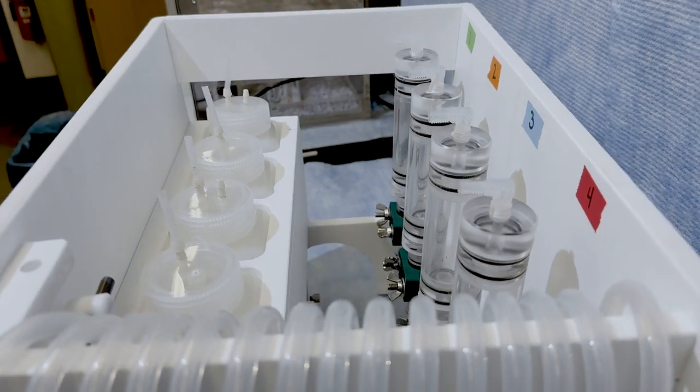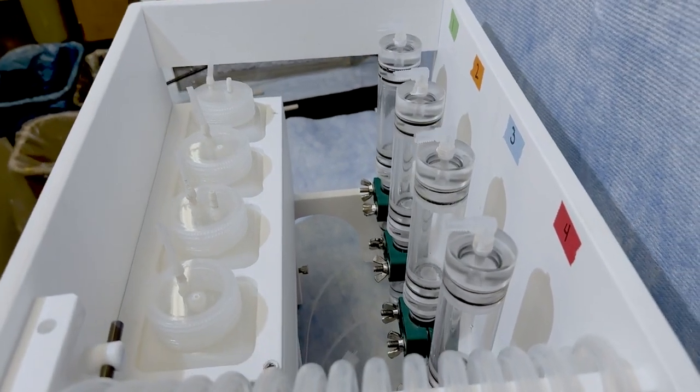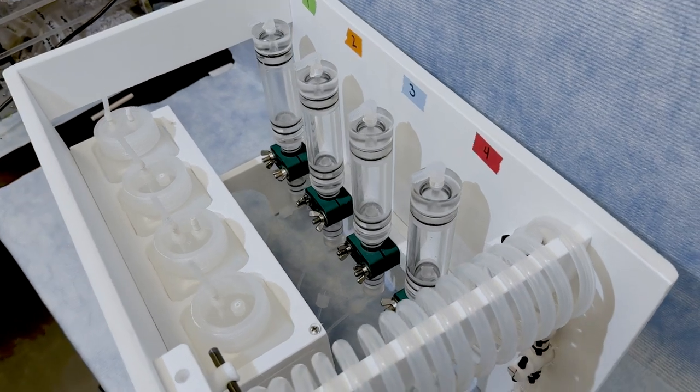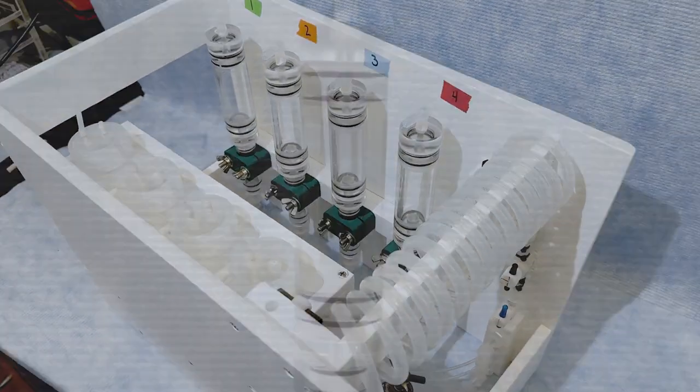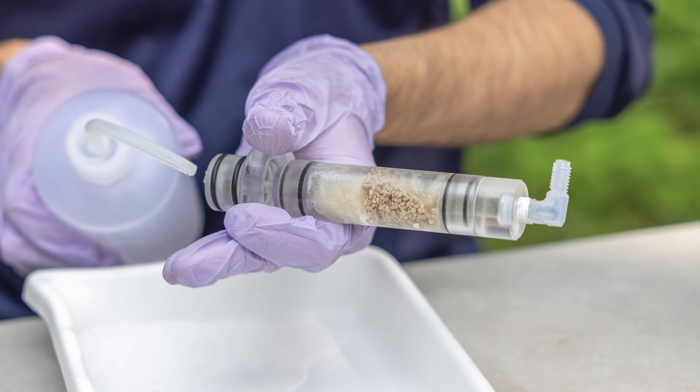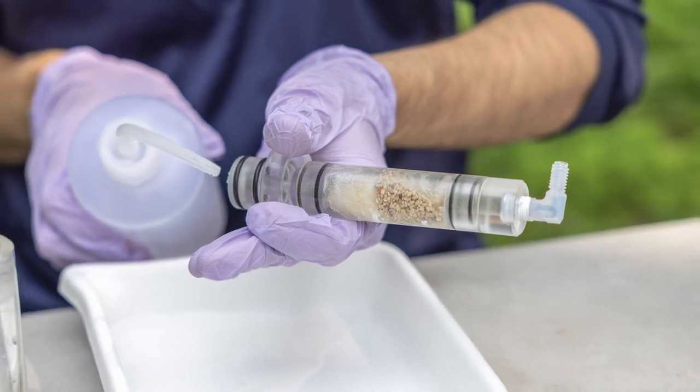Once the water is properly oxygenated, the water flows past an overflow system to a manifold, where it is then diverted to 4 different iTIE units. Each unit consists of 2 parts, a resin chamber and an organism chamber. Site water first passes through the resin chamber, where the water slowly flows through an ion exchange resin matrix.